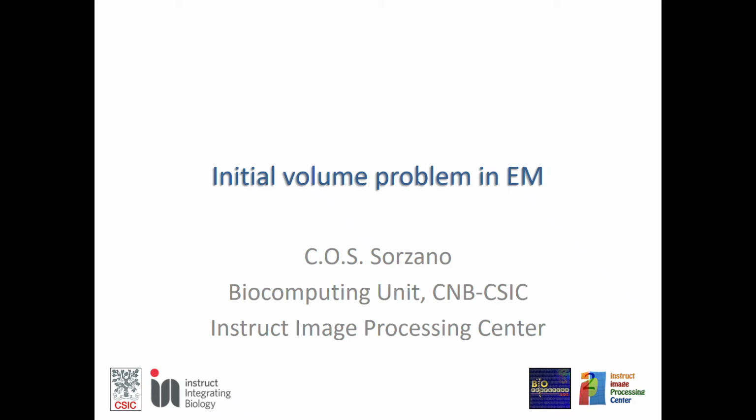So the next topic in this series of lectures is about the initial volume problem in electron microscopy. For these slides, I have chosen a presentation I did like 7-8 years ago, and the ideas are still the same, but the conclusions are now quite different.